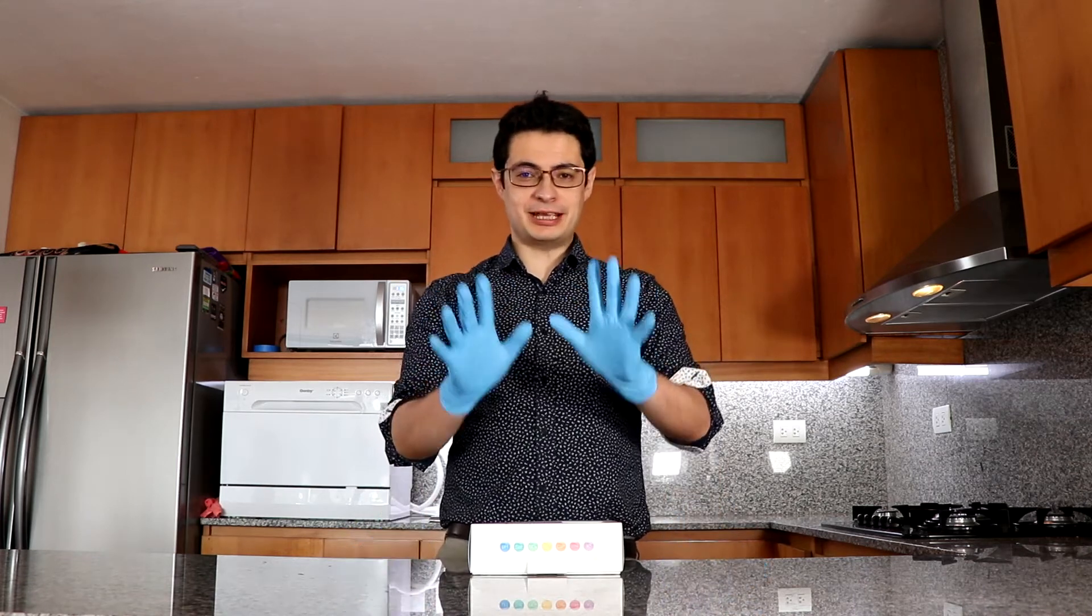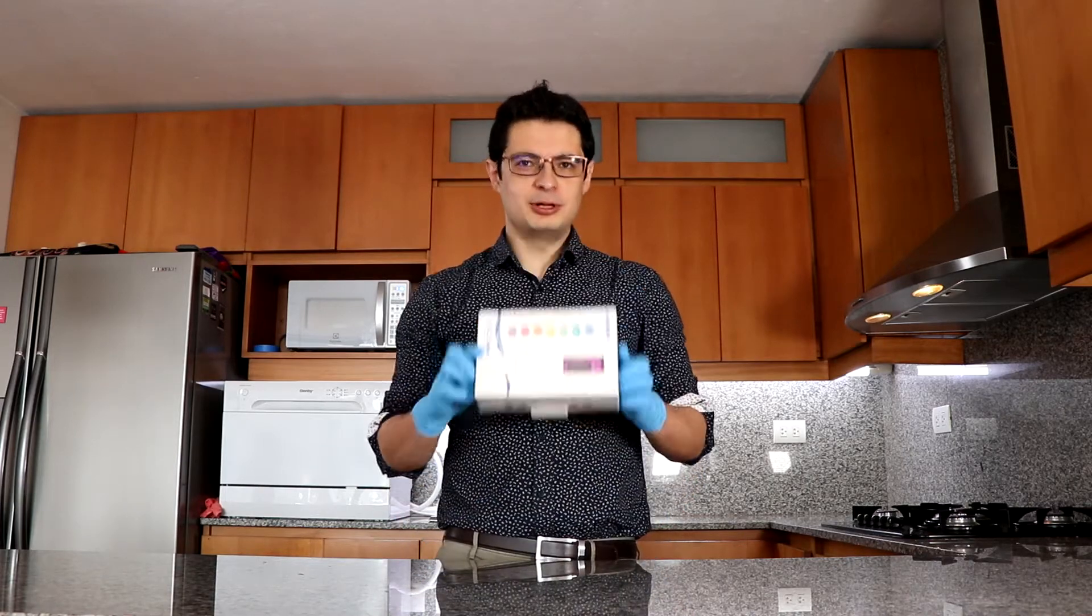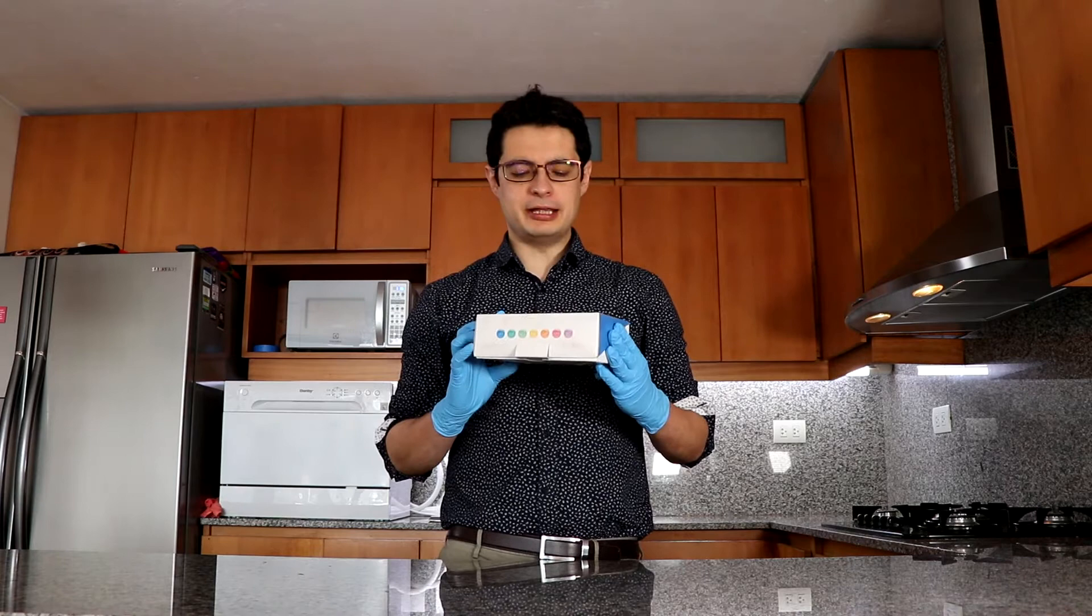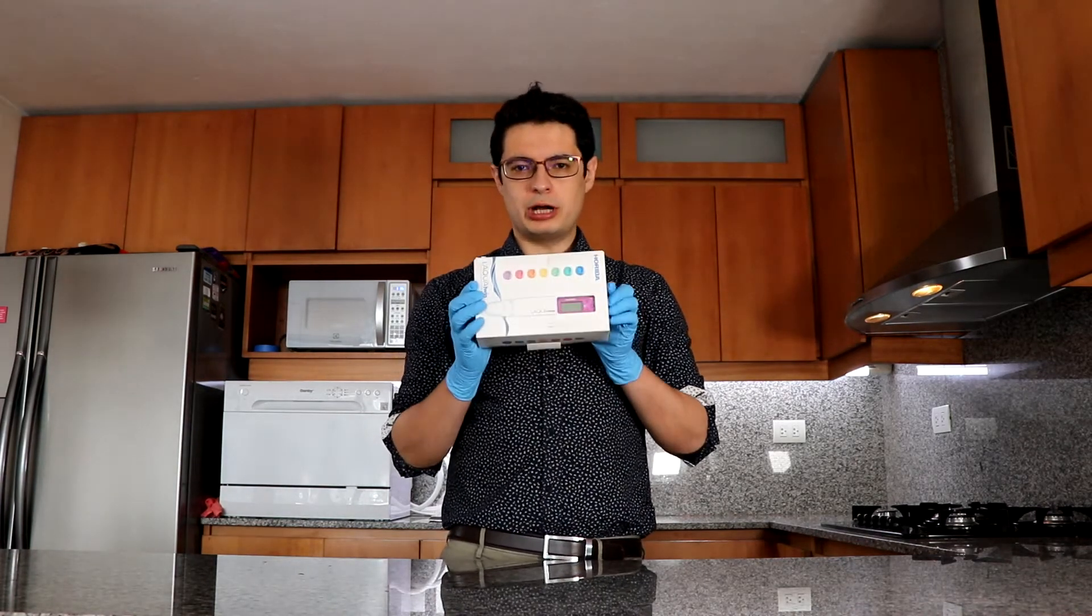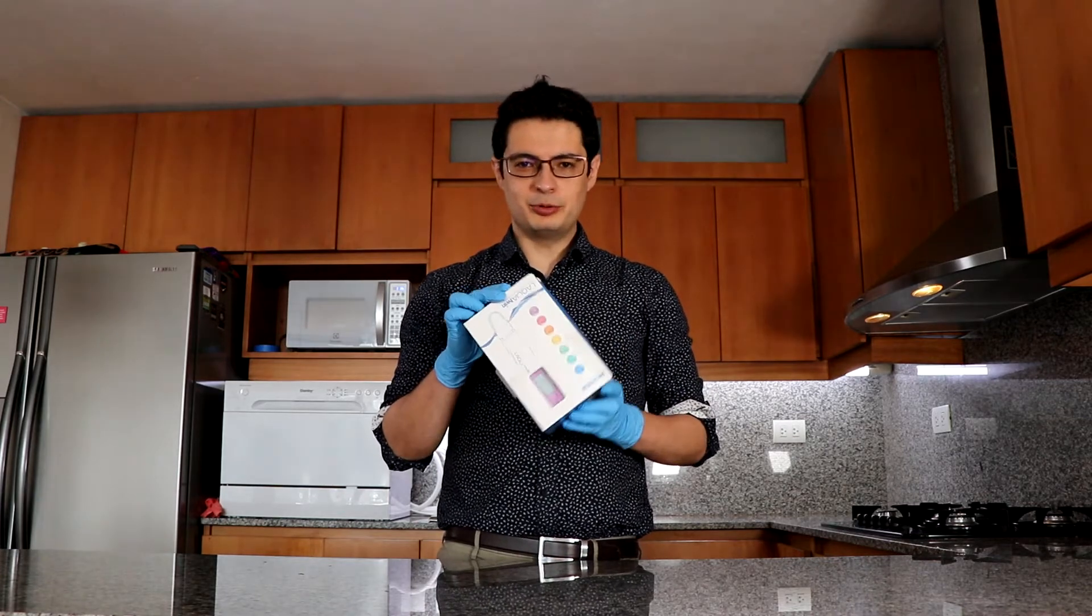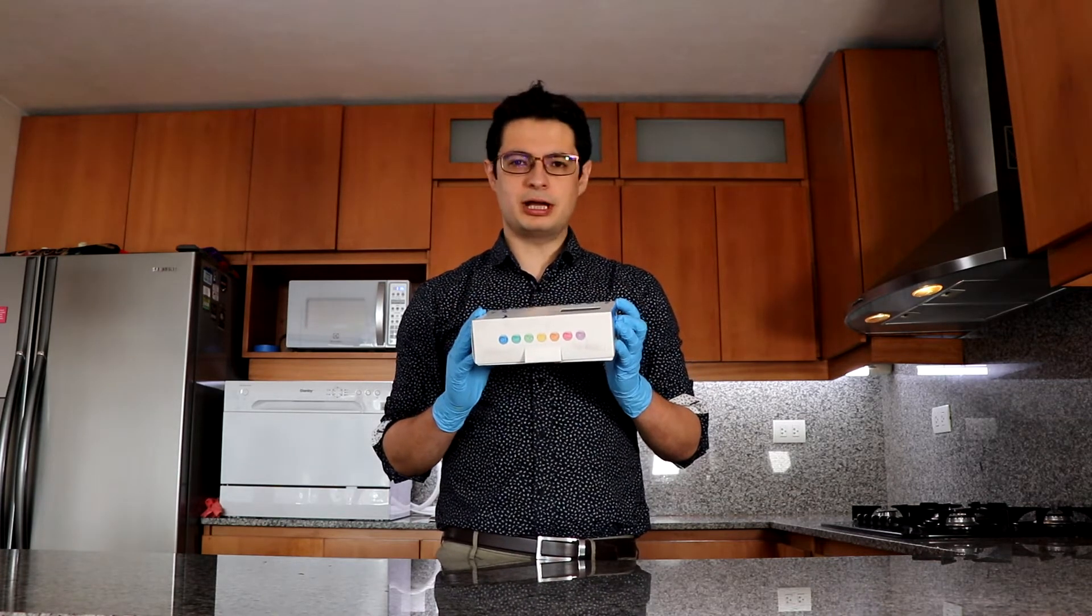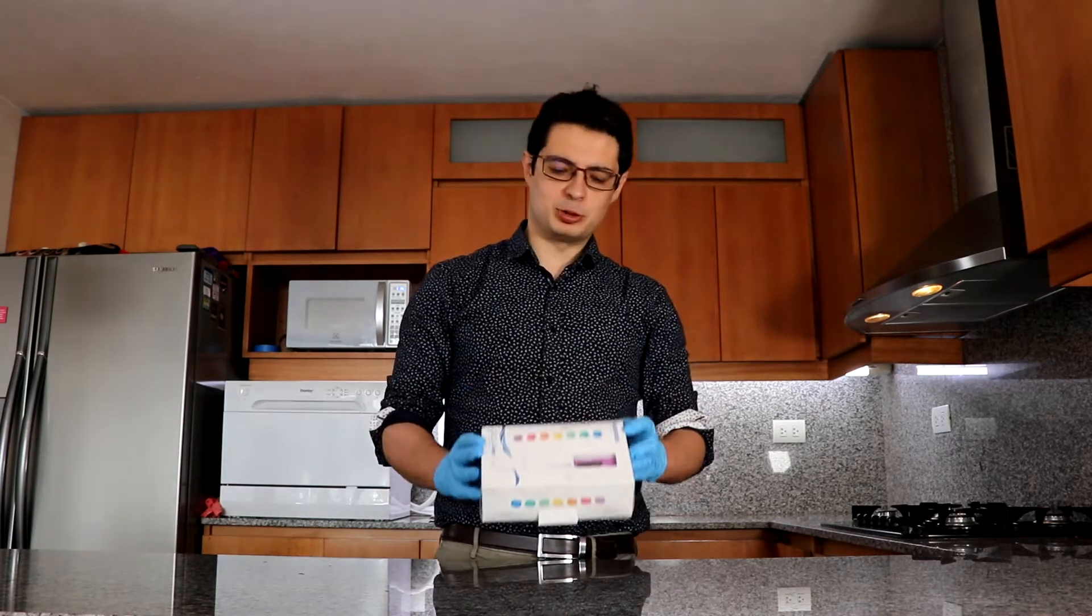Hello, my name is Daniel Fernandez. I am the owner of ScienceInHydroponics.com and today we're going to be doing an unboxing video where we will be looking at this potassium ion selective electrode. We're going to open the box, calibrate it, see what's in there, and then perform a measurement of a hydroponic solution. Let's go.